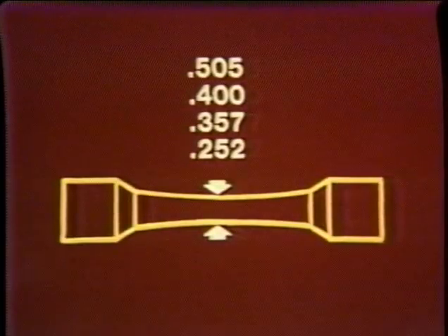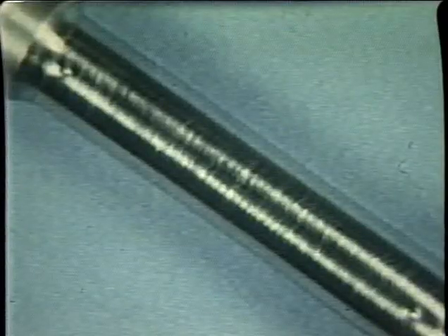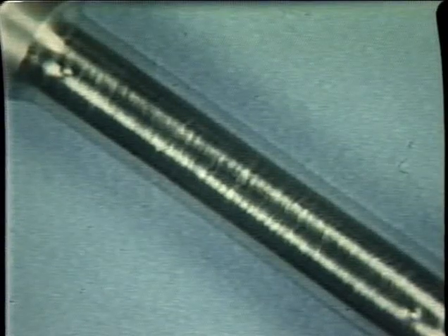They are sometimes used as names to describe the tensile specimen. For example, an inspector may call for a 505. The finished surface should be smooth enough to prevent premature failure. A rough surface could cause a fracture in an undesirable location.